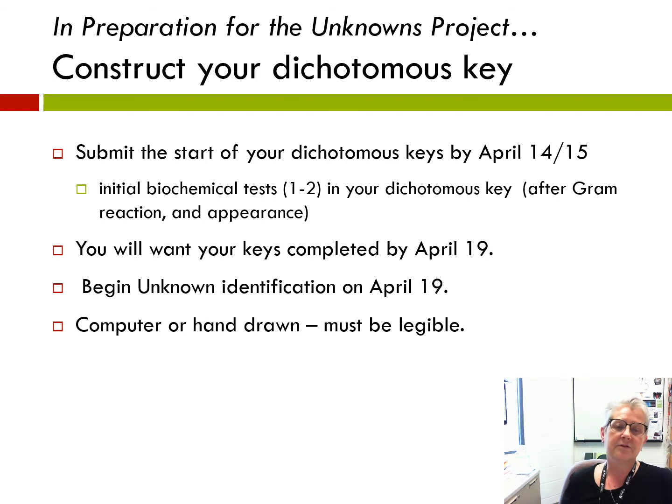So I'd like you to submit the start of your dichotomous keys by about April 14 or 15. So just those first initial biochemical tests after you've done the gram reaction and shape. I'd like to at least take a look at them to see if you're off to a good start.